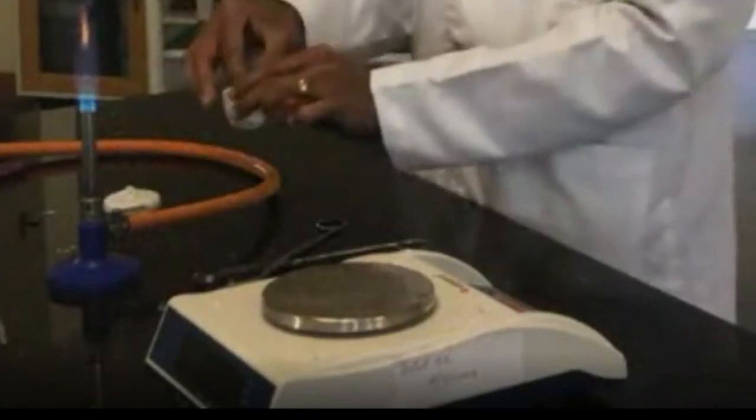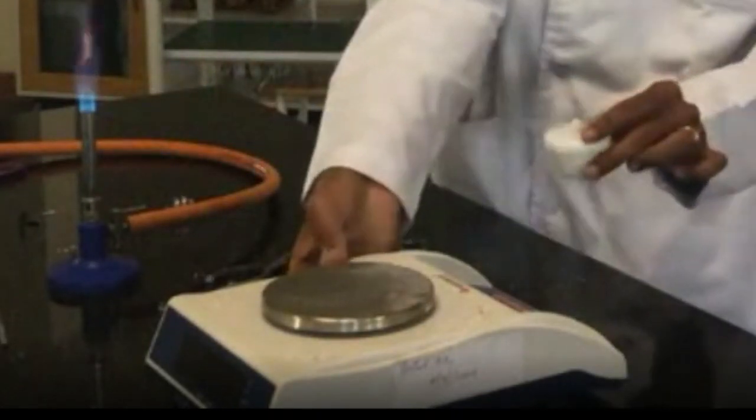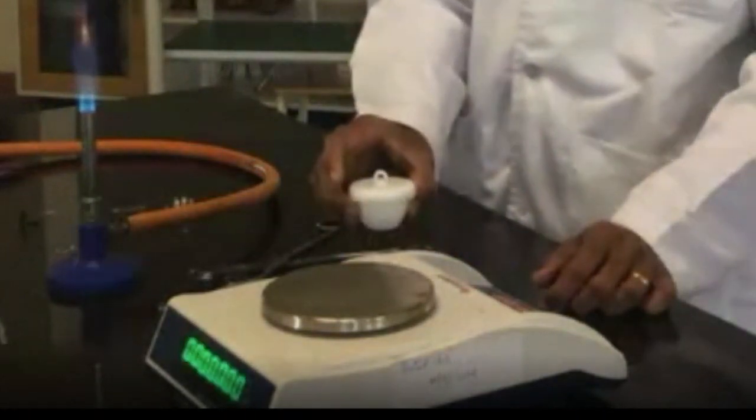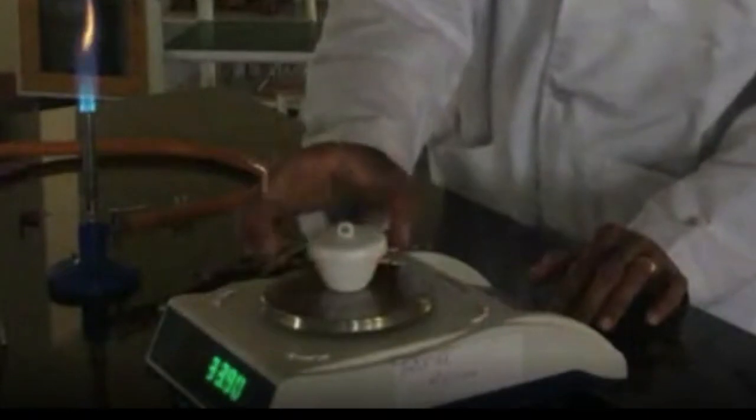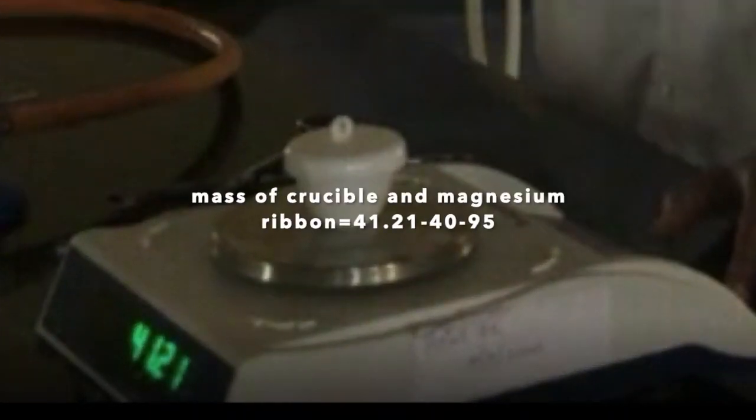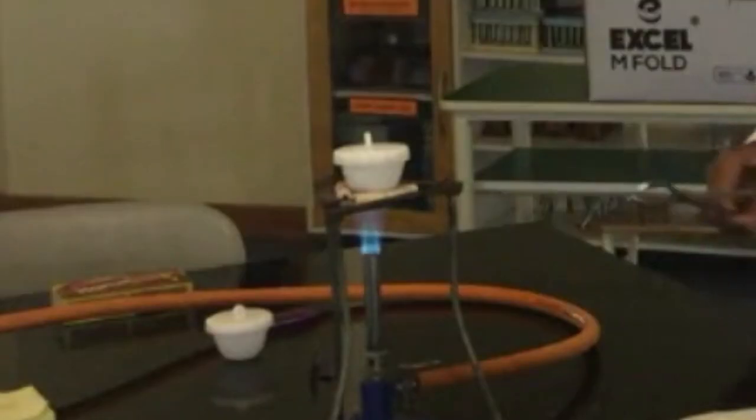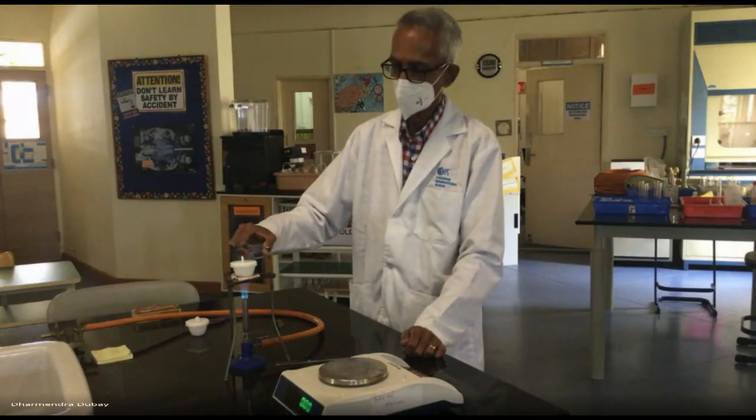Before burning it, I will weigh the empty crucible with the lid using a 2dp balance. So the empty crucible with the lid is 40.95, 41.21.